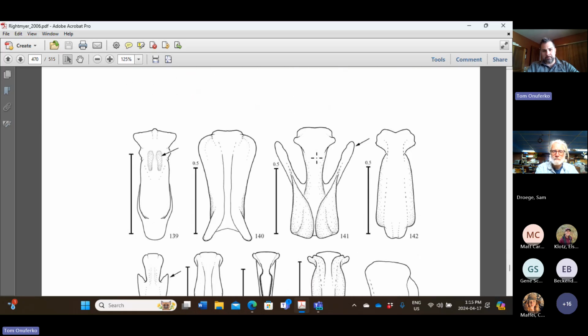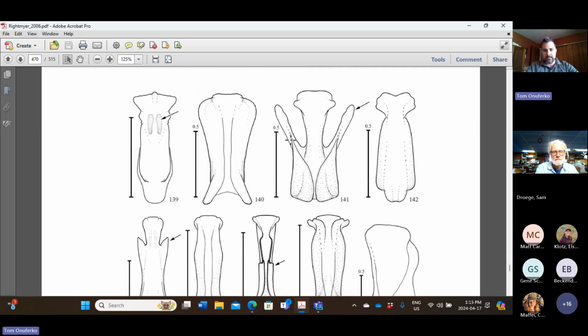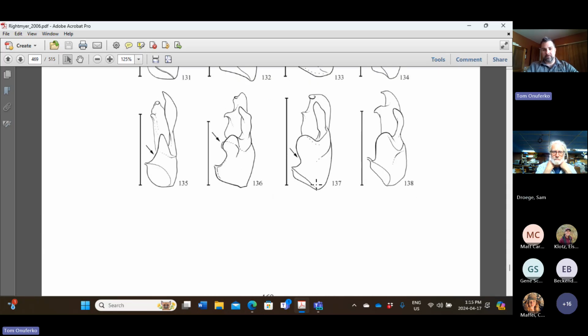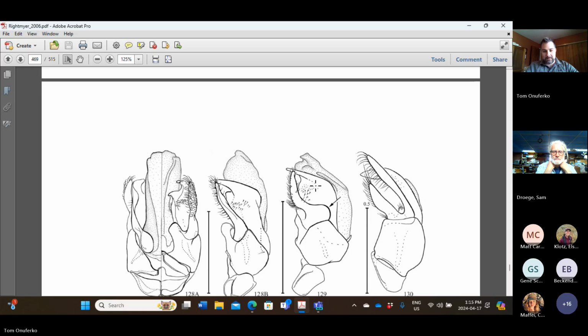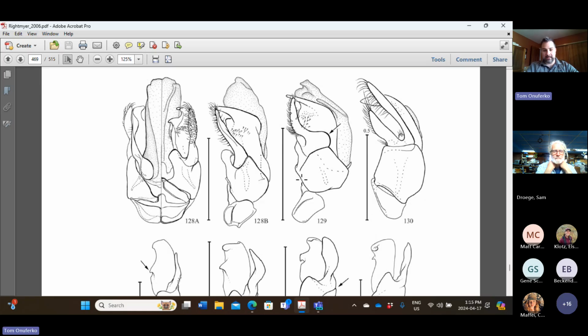These are images of the penis in Epeolus. In most species, and there are some exceptions, the penis itself has a pair of these large fleshy lateral lobes. Those are absent in Epeolus bifasciatus and the species in the Trophocleptria group. But if you're really not sure and you don't want to go through the trouble of barcoding specimens or something like that, you can always excise the terminalia.